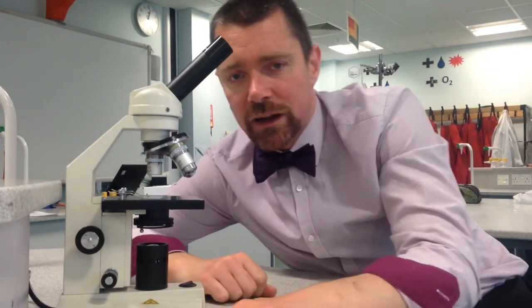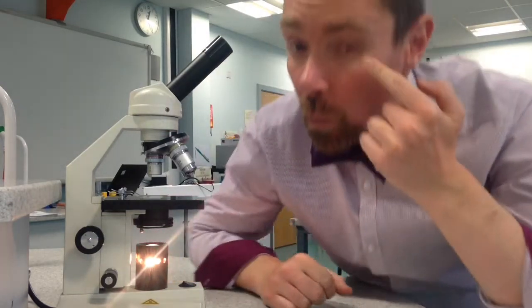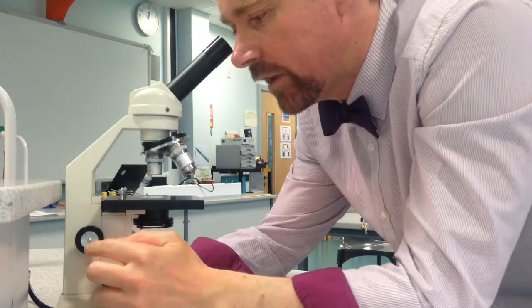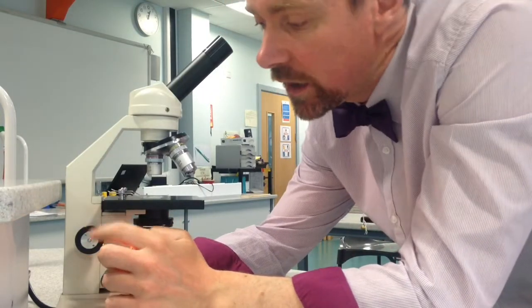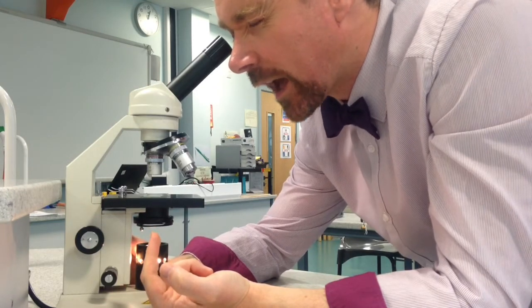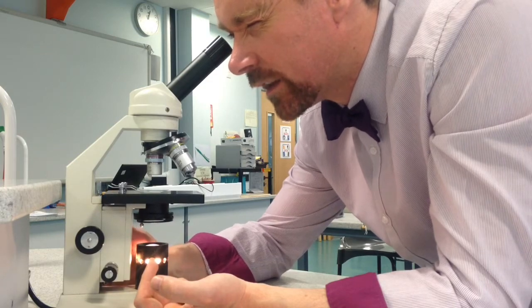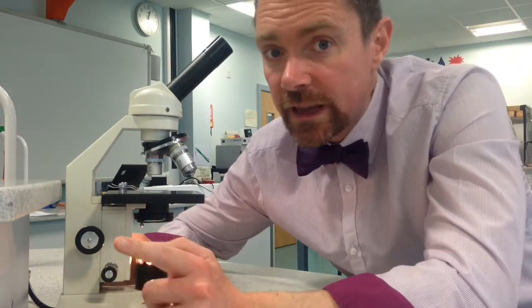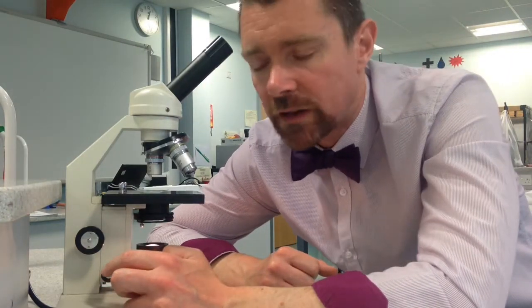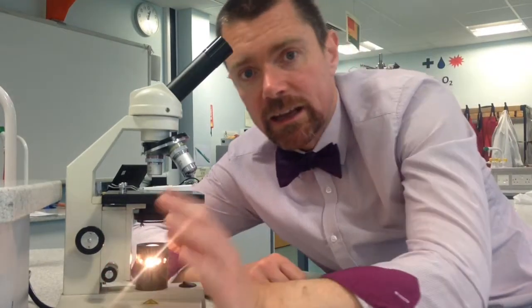We are now ready to have a look at our sample, Year 7. The light bulb goes on. Shut one eye, and with the other eye we're going to look through the eyepiece lens, and then very gradually you're going to turn the focusing wheel so that the stage moves upwards. Very slowly move it upwards until your sample comes into focus. Once you can see the sample, you can then use the second focusing wheel down here, which is called the fine focusing wheel, and you can use that to get a really, really clear image.